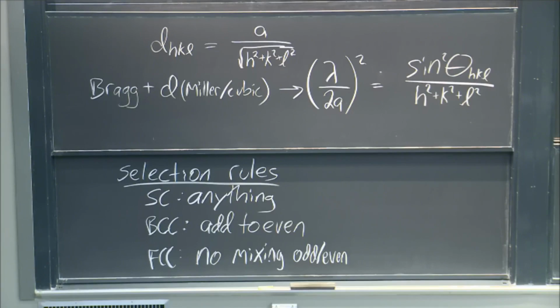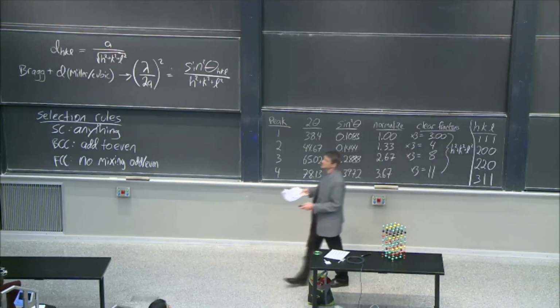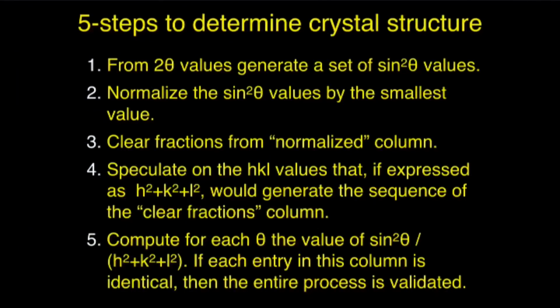And that's actually the last step in the recipe. Did I put the right? Yes. All right. This is the recipe I gave you on Wednesday for you all to become crystallographers, X-ray diffractioners. That's okay. We'll make it work. You're X-ray diffractioners. And the thing is, you got to remember how powerful this is.